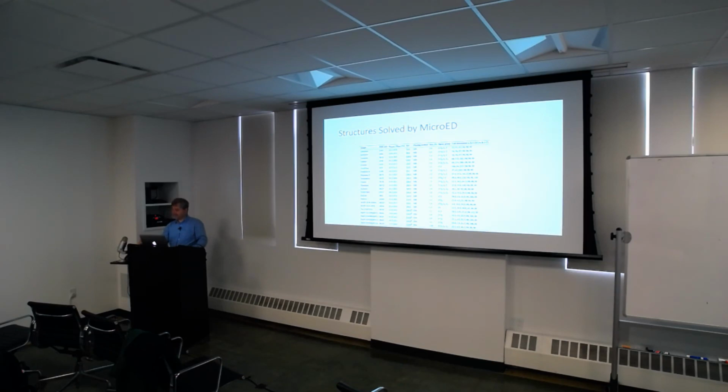I think basically you're talking about length scales, right? I've seen crystals personally that will curve like this, but on that small enough scale they'll be ordered. The ones that are similar enough will crystallize, and the ones that are not won't. Or might poison itself somehow. Well, that's what these little peptides are, they basically cause the structure to have some sort of strain. It couldn't grow big enough.